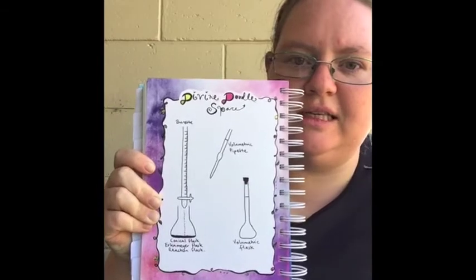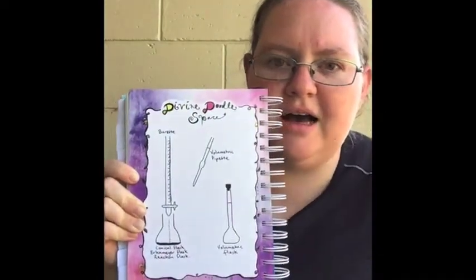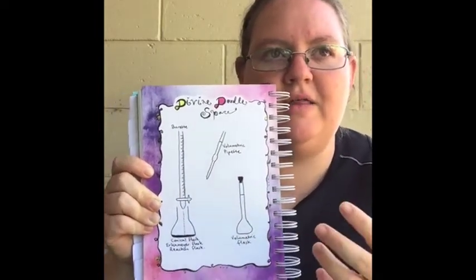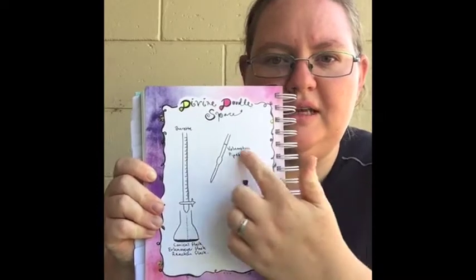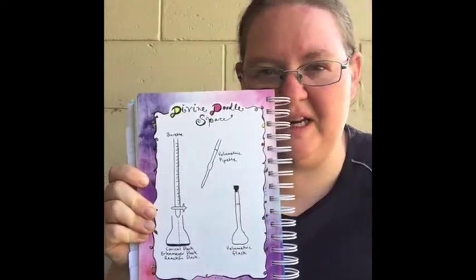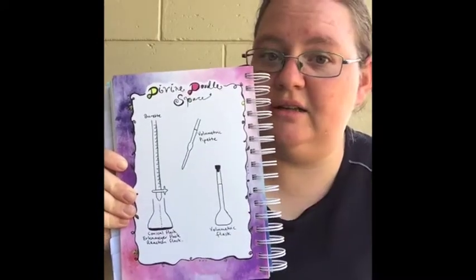The other thing to consider is that all of this glassware — especially the volumetric pipette and burette — is very accurate and calibrated on the assumption that you are using it at approximately room temperature, which is around 20 to 25 degrees Celsius. I believe they're all calibrated for 20 degrees Celsius.